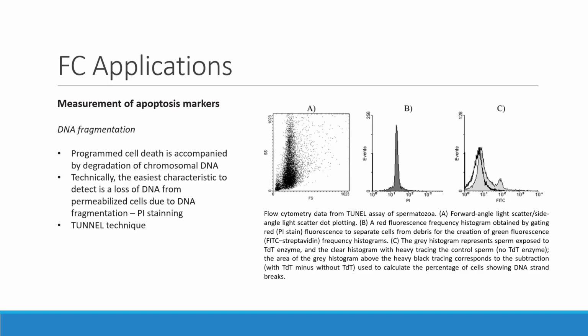The advantage of this method is that it is very fast, inexpensive, and simple. Furthermore, it detects cumulative apoptosis and is applicable to most cell types. However, the method may not detect cells induced to apoptosis in the G2M phase. An alternative method to identify DNA fragmentation involves the identification of the nicks or strand breaks using the TUNEL technique.